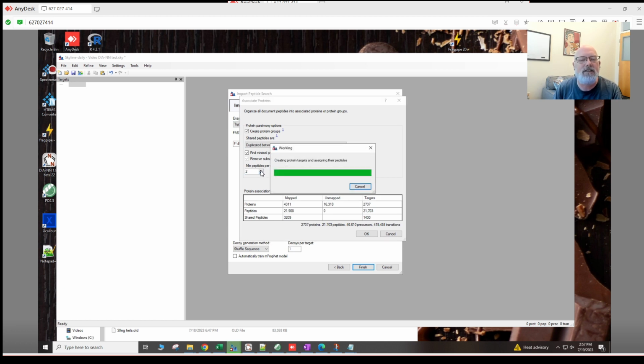Oh, did I accidentally do this the wrong way? Okay, come on. Did I do this 1 or 2? 1. Okay, so now we're back up to 3,753. In my experience, after looking at hundreds of data sets, I have found a lot of proteins that are identified with one peptide that turn out to be very valuable. So I usually keep them. Okay, so then I hit OK. So we got 3,753. And you may want to experiment with these to see which works best for you.